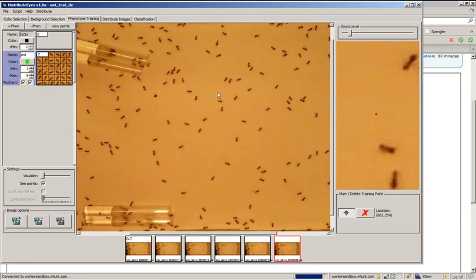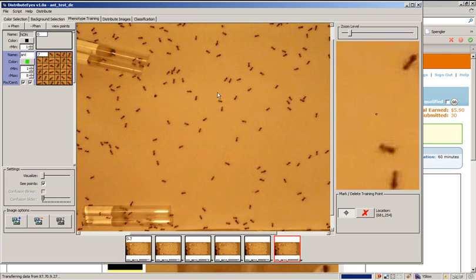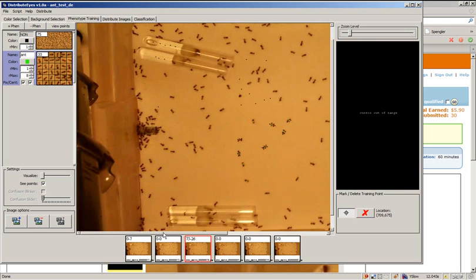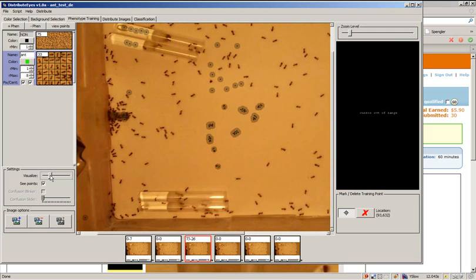Wait a few seconds for our phenotype training page to update with the new data. There we go. Here's the data submitted by the mturk worker, which of course was us. Looks exactly like the points we just made.